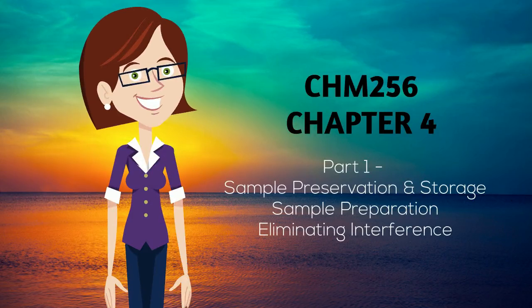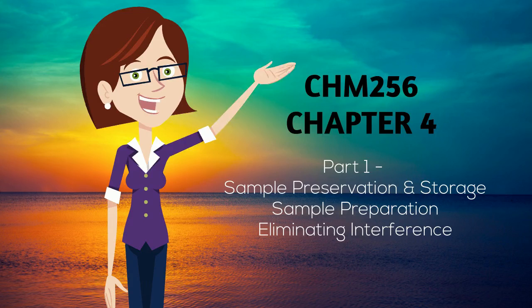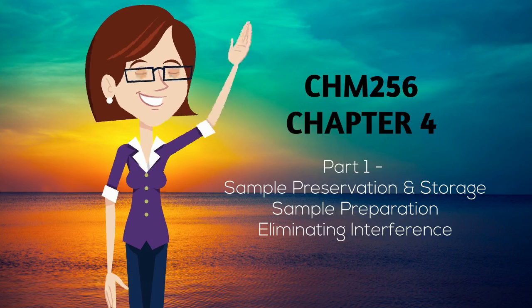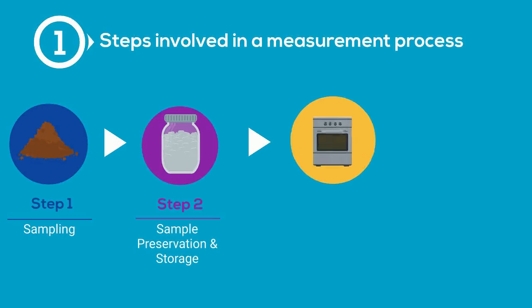So in this video, I will continue with the other subtopic in chapter 4, which is sample preservation and storage, sample preparations, and eliminating interference. First, let's take a look at the steps involved in the analytical measurements process.